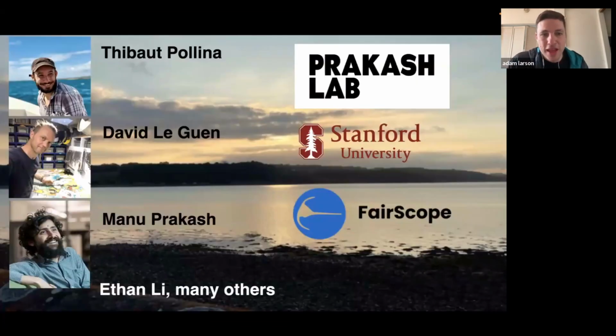And yeah, I just want to thank, again, this has been a huge project, and I can't really thank everybody that's been involved, but it's been really amazing. But the true heroes are Thibaut and David. Thibaut got me involved in the whole DIY community and got me involved in plankton, actually, so it's been a wonderful journey. And Dov has been really heroically making a lot of these plankton scopes and making them better and getting these designs to the point where they're extremely robust now and able to be put together in a few hours and taking plankton wherever you want.